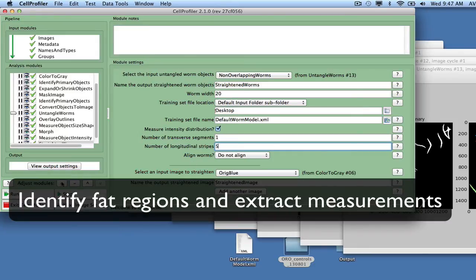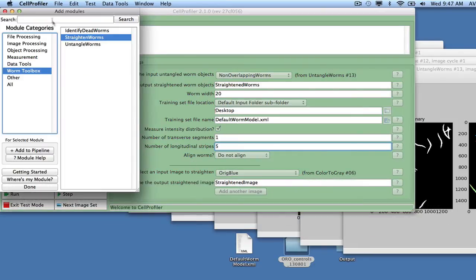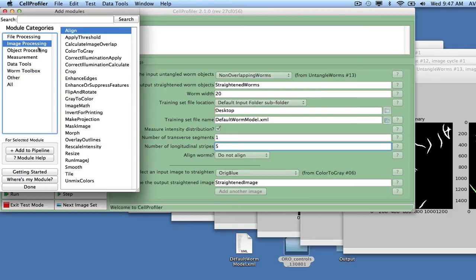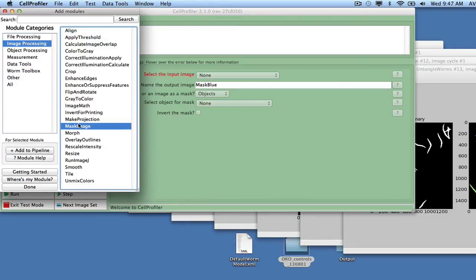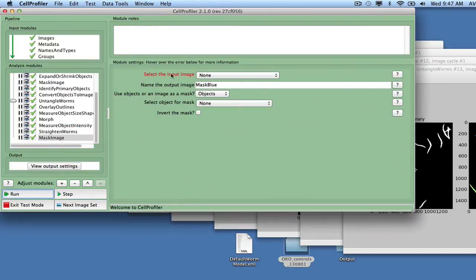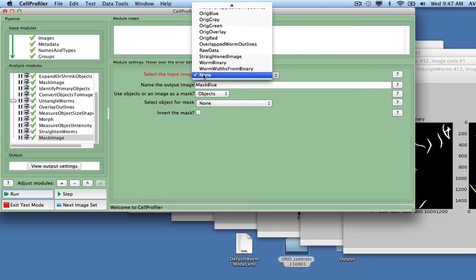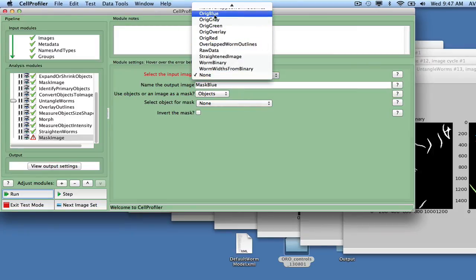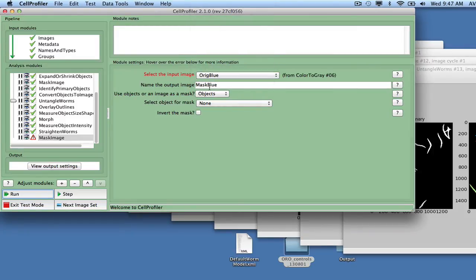Before identifying the fat sub-regions of the worms, we want to mask away all regions in the image that should not be considered as a worm. We do this by adding the Module Mask Image. Set OrigBlue as the input image and Worms Binary as the masking image.